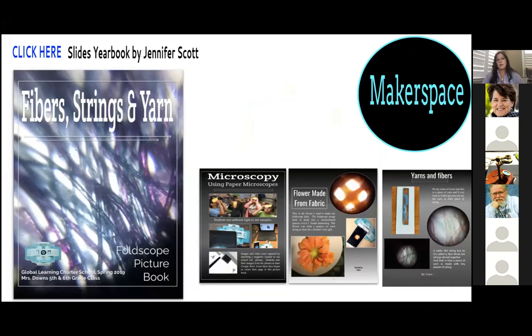Another thing I did was we worked a lot with fibers, strings, and yarns, just to get used to focusing and then taking pictures, because my school has a cell phone set that we use for AR and VR that we just tape the coupler onto so that the kids could start to capture their images. I know some classes have iPads. The only thing is that for us, the iPad case had to come off, so you just have to be careful if the kids are walking around with devices with no cases. Our cell phones for our AR and VR cart don't have cases because they won't fit in the Google goggles.